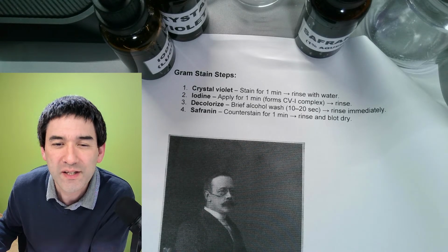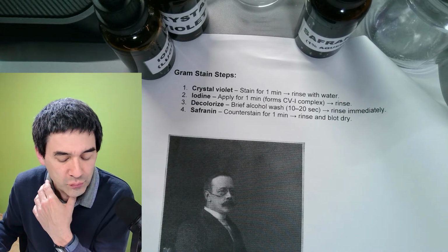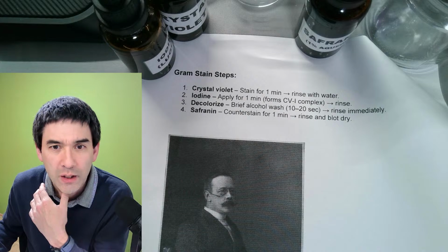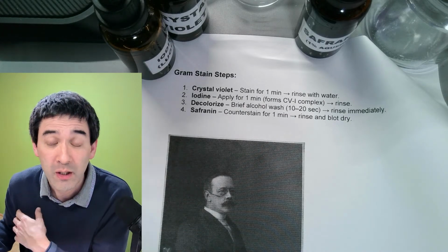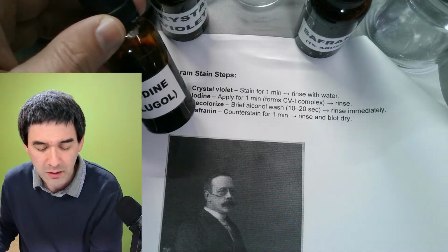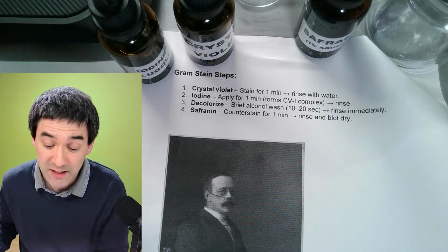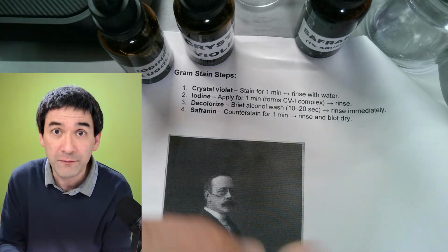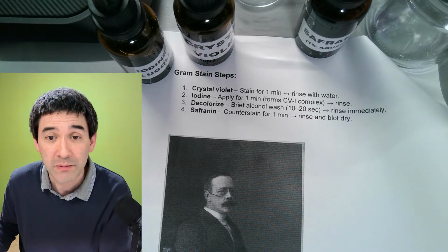Are there risks involved in performing the gram staining? No, not really, because the substances used are not really dangerous as such. I'm not using methanol, that's important. The stains are standard stains and there should not be any risk. I will tell you what the risk is: it is because I'll be heat fixing the cells. This means I'm going to be working with a fire, of course, and that might be a risk.